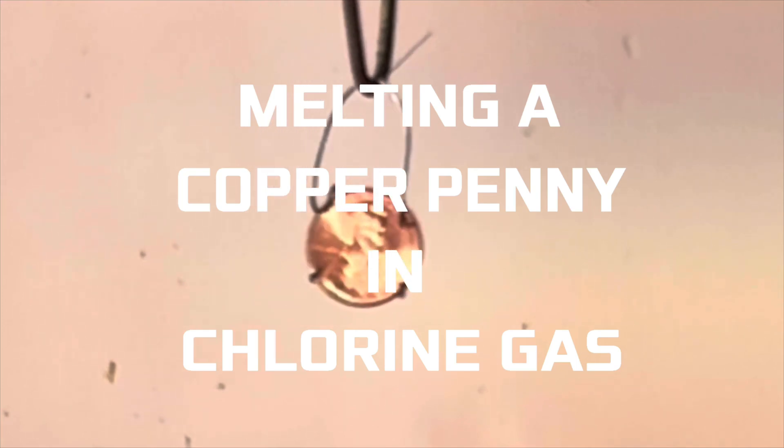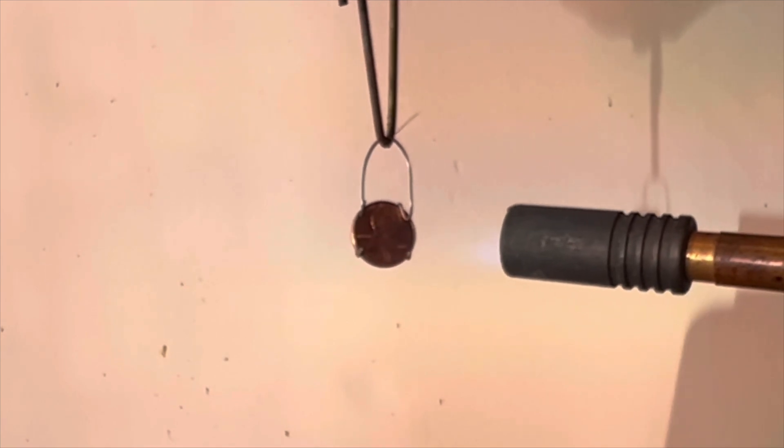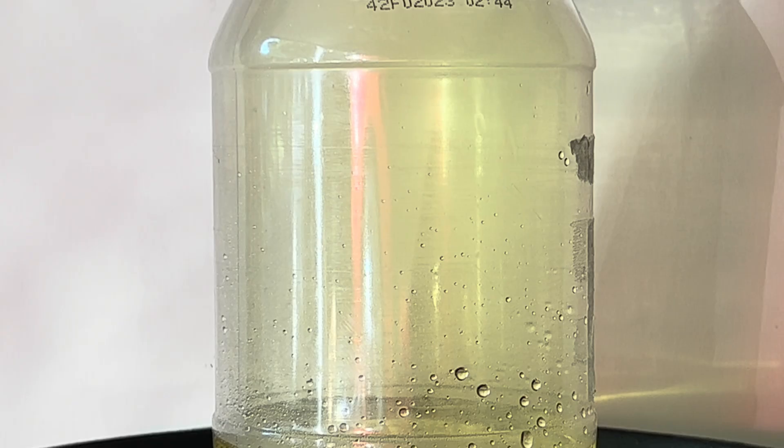Melting a copper penny in chlorine gas. This is a pre-1982 penny in a stainless steel wire holder. It has to be preheated with a blowtorch. This jar is filled with chlorine gas.